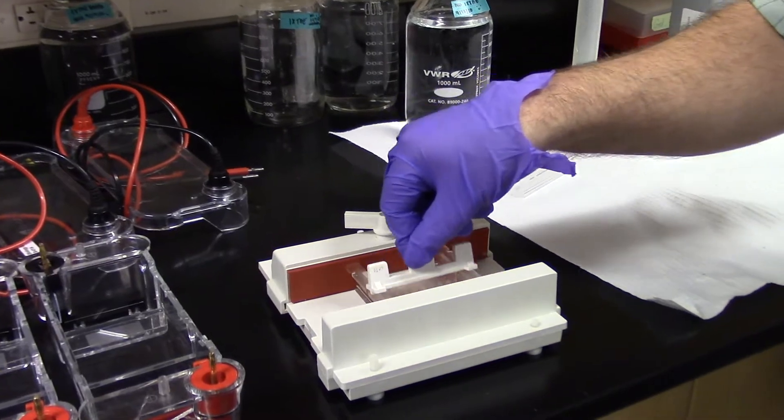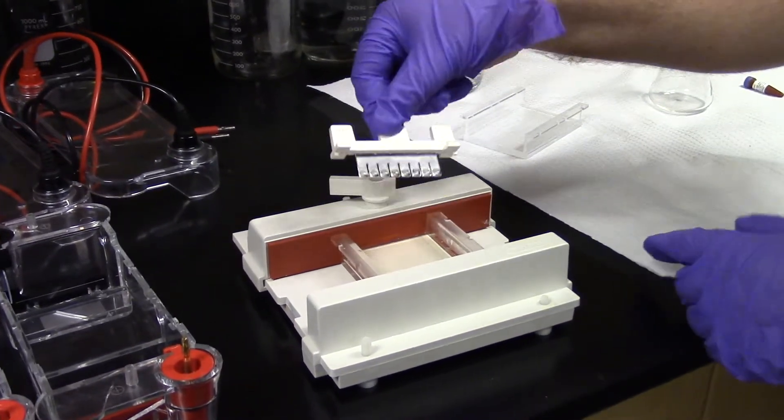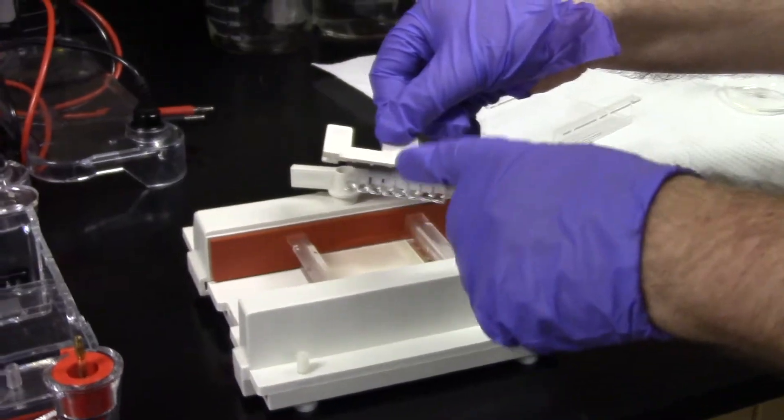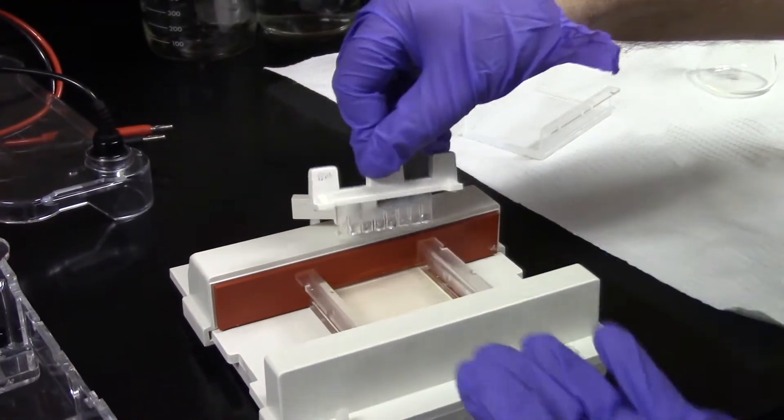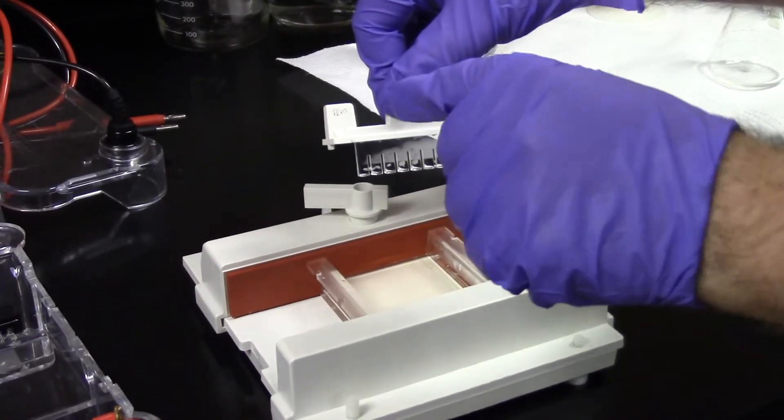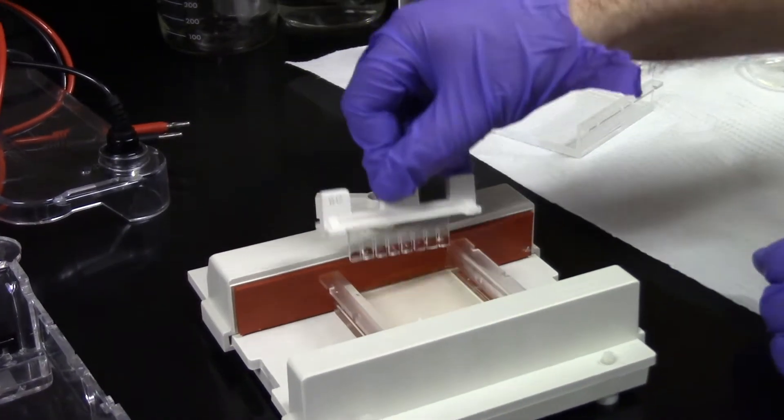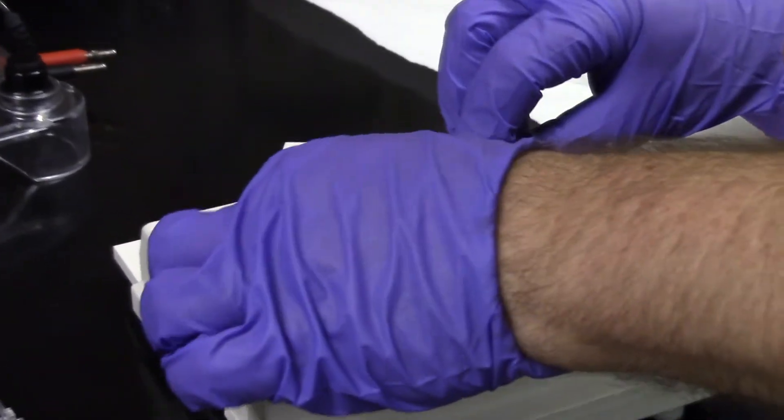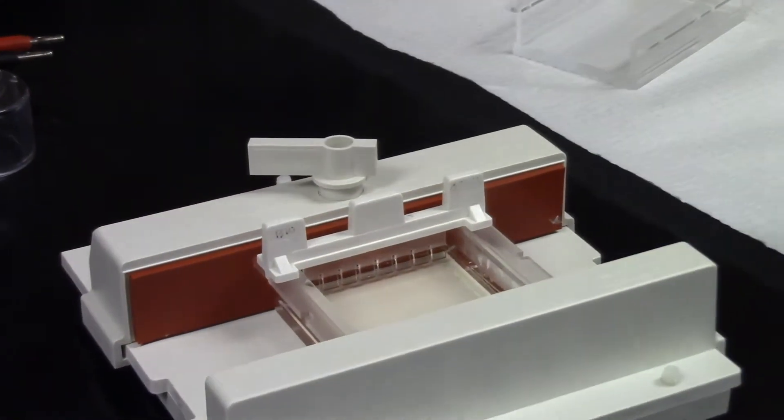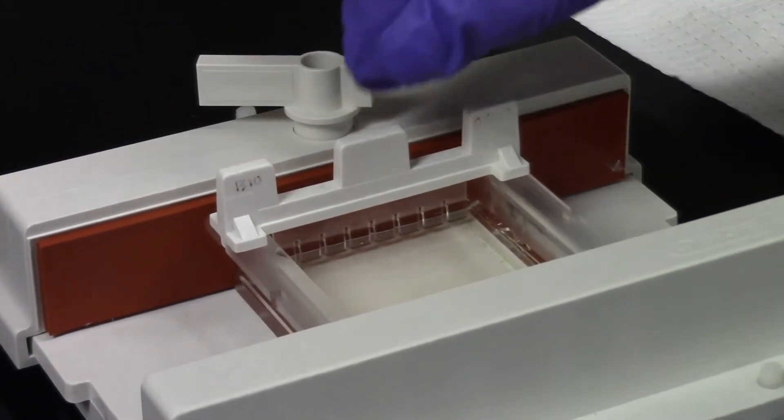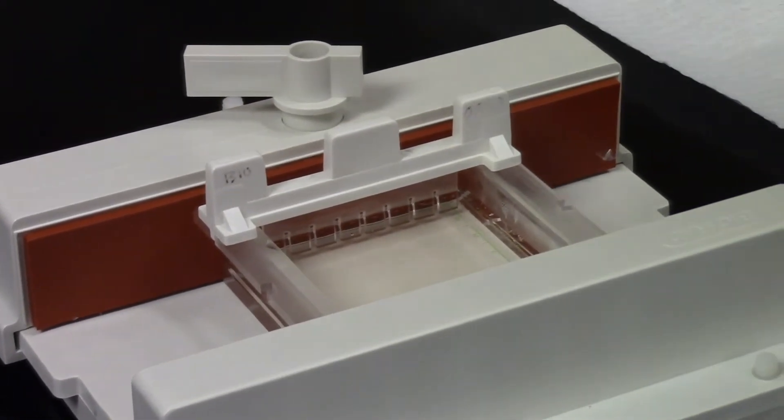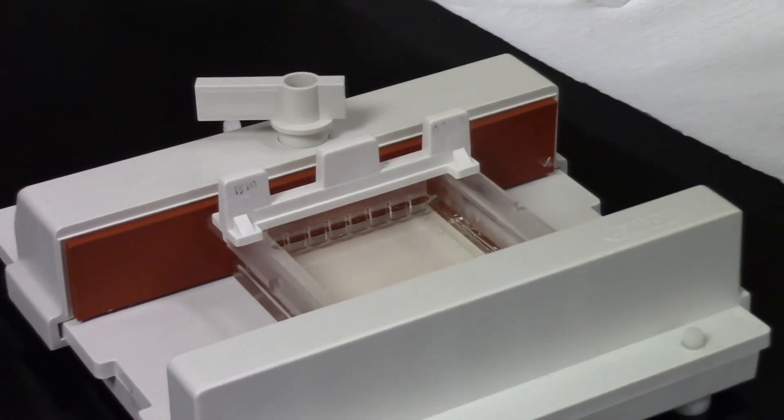I'll remove the bubbles. And I'll place this comb. The comb has slots in it. The slots will have gel between them. The place where it's plastic on the combs will displace the agarose liquid. So that when I pull this out after it has solidified, there will be wells.